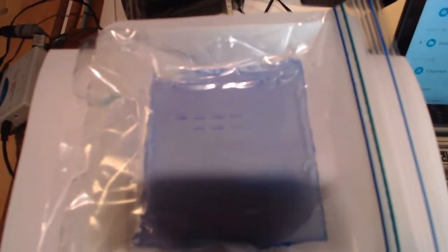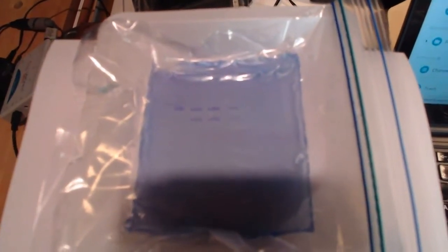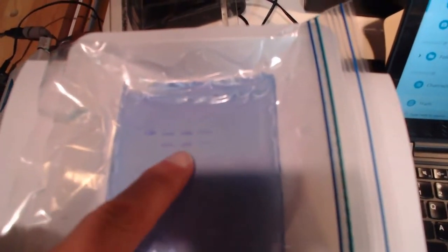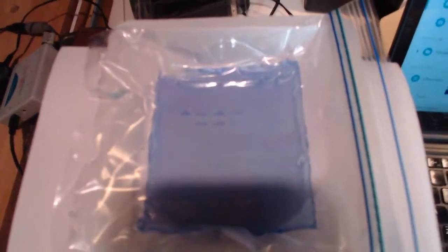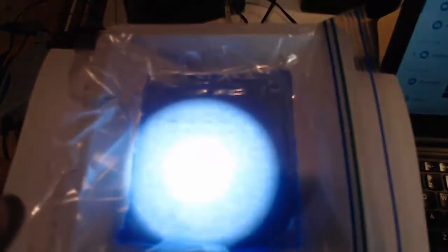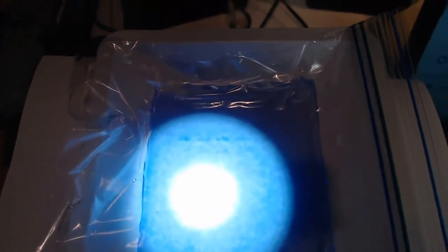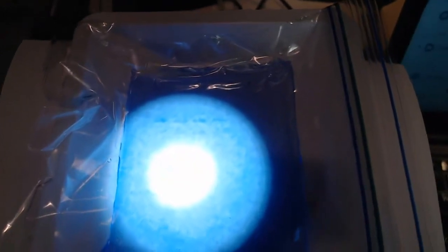You can imagine different samples, like from forensic science. Maybe this was one suspect, this was another, these two match, and this was another. We could say that maybe this was from a crime scene, this was a suspect, and the DNA samples match. Again, I'll turn on the light, but it's a little easier to see maybe without the light, but you can see there the DNA samples.